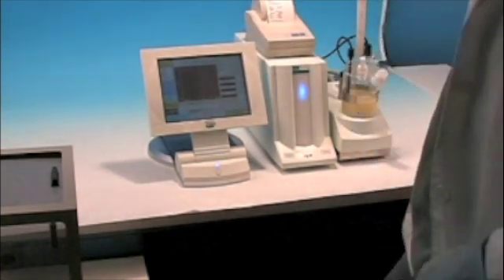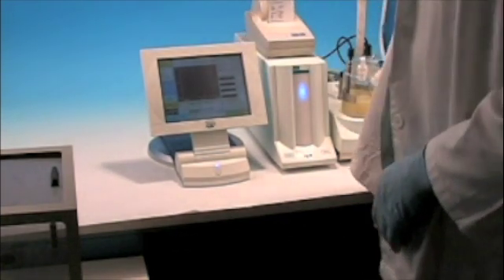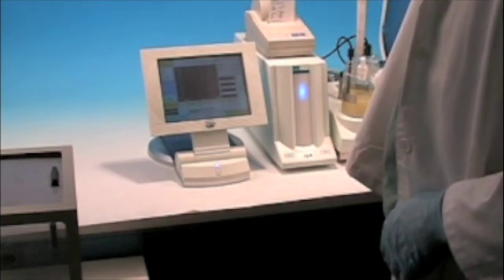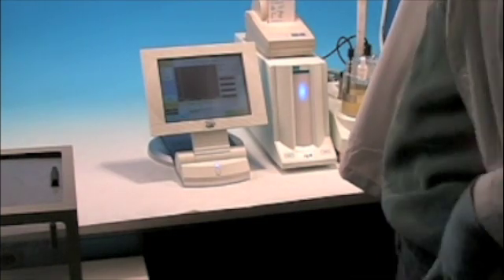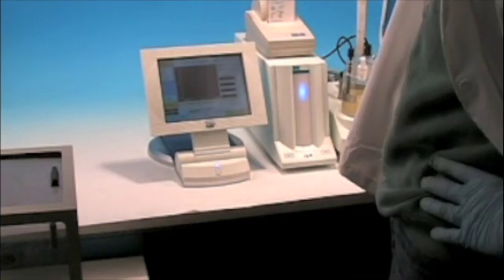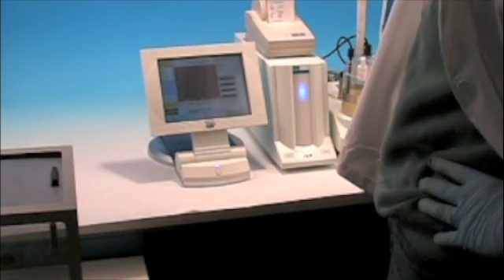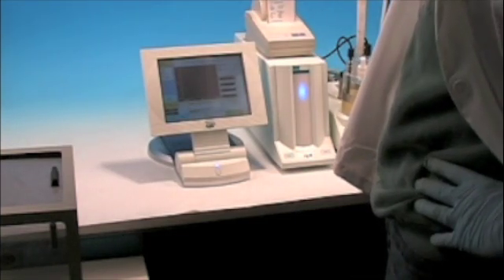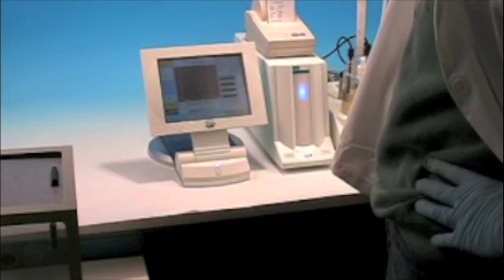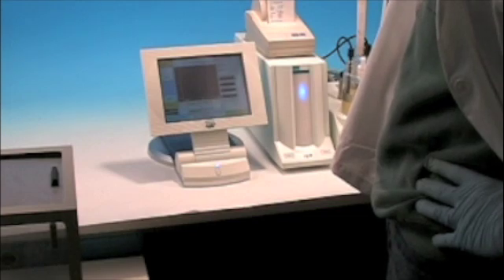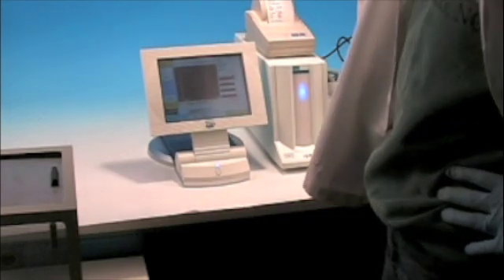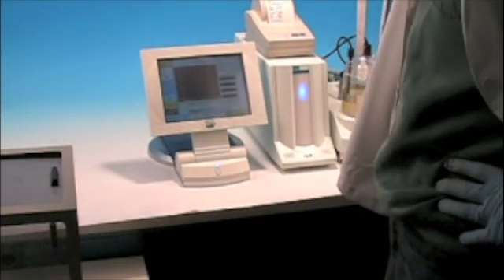So what we did is we ran six tests on this sample, and we ranged between basically 800 parts per million and 900 parts per million.